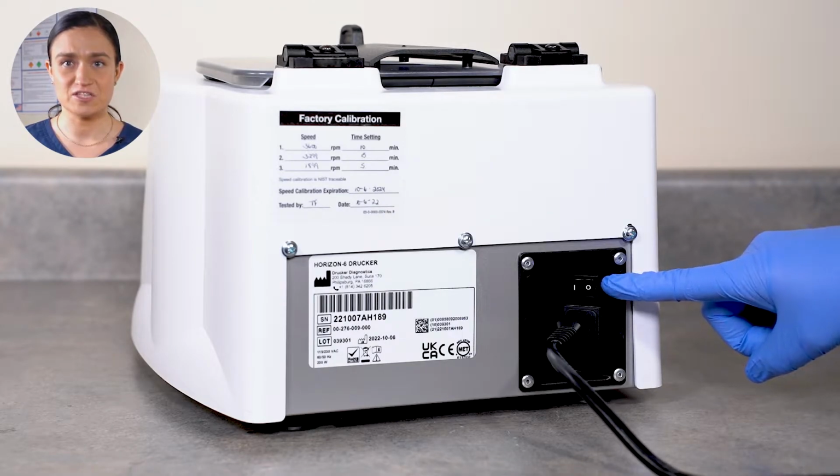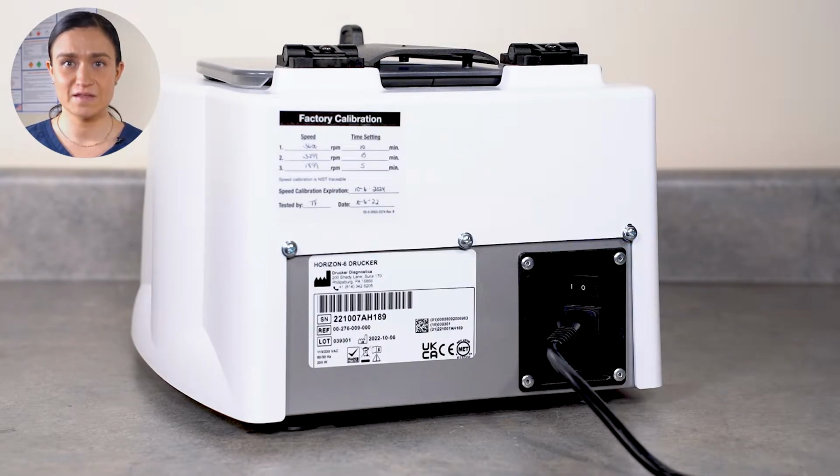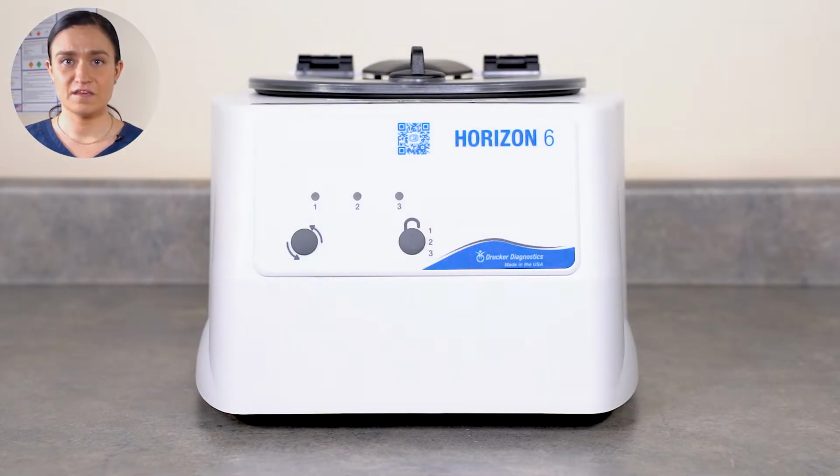Locate the power switch on the back of your Horizon 6. Flip this switch to the on position. With the Horizon 6 plugged in and switched on, its lid lights will flash and the first cycle light will illuminate. Now we're ready to unlock our centrifuge.